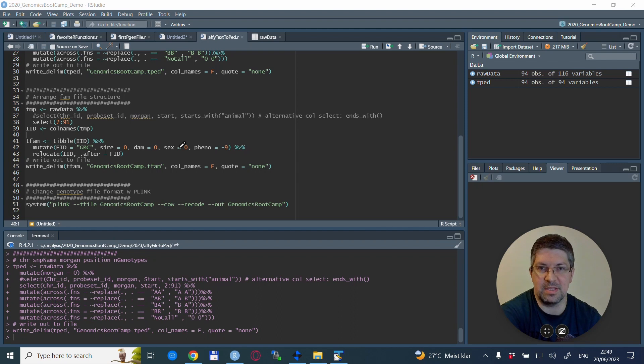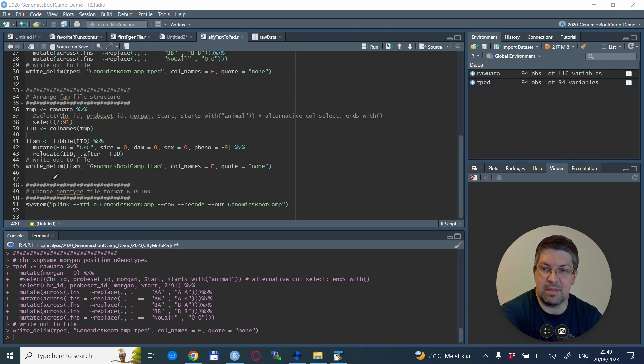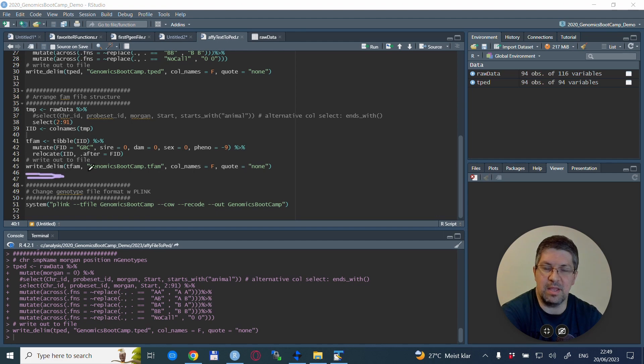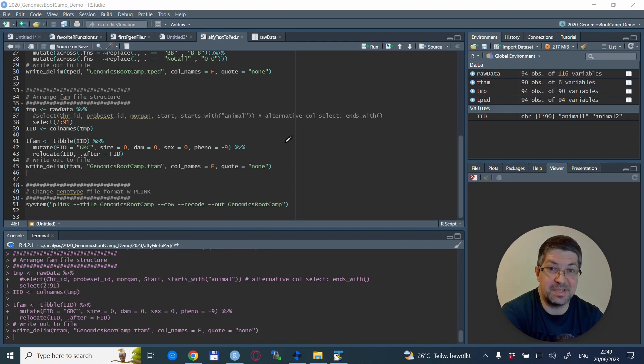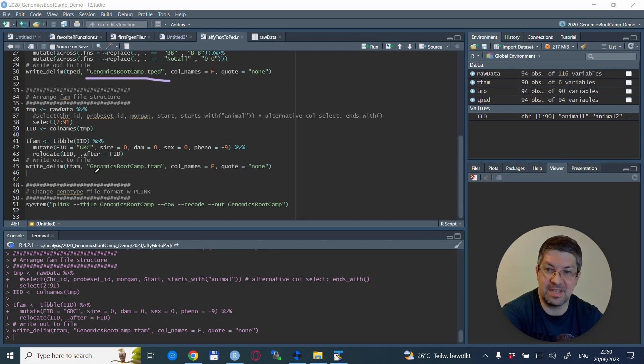And now, nothing else remains than to put together the fam file. So it starts with the family ID. In my case, I selected or opted for an expression GBC, but of course you can use any expression that you see fit. Then I define the sire as zero or unknown, dam as unknown, sex as unknown, and phenotype as unknown for this particular example. With a bit of rearrangement, there is now the setting that the IID goes after the FID, so we have the conventional structure of the fam file—that is, the family ID, individual ID, sire, dam, sex, and phenotype.